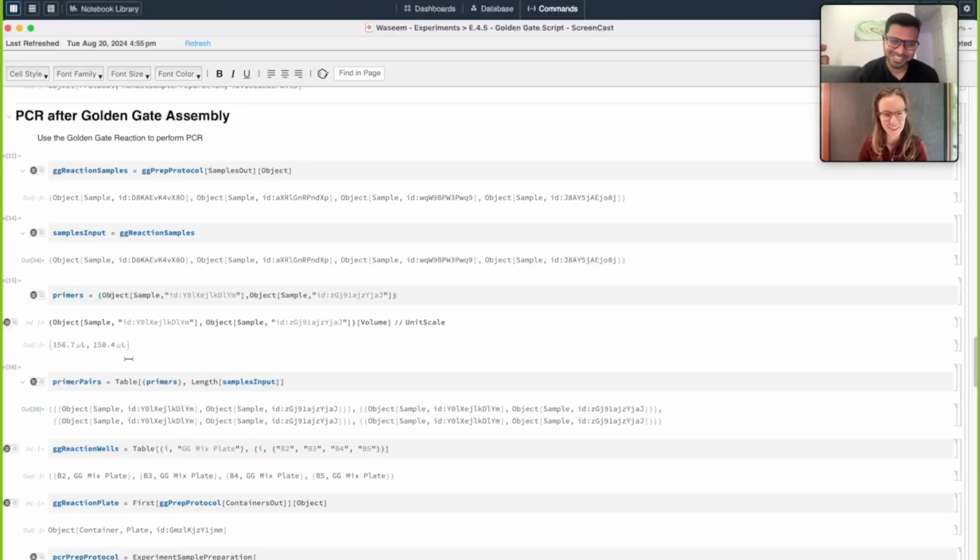Yeah, fair enough. So you have to be mindful about that. That's why I try to check the volume itself here. It will also give you a warning. Yes, it will definitely give you a warning that there is an insufficient amount of volume.